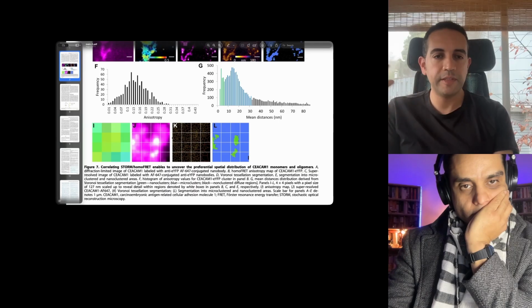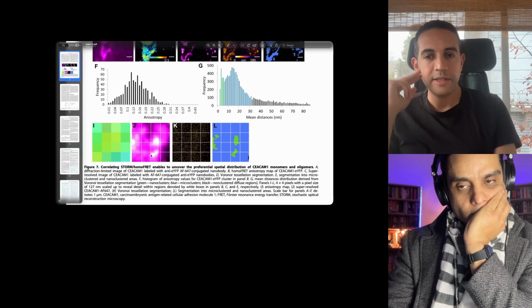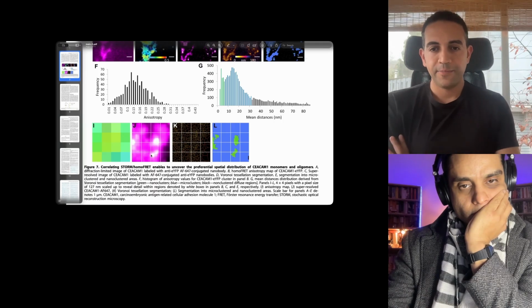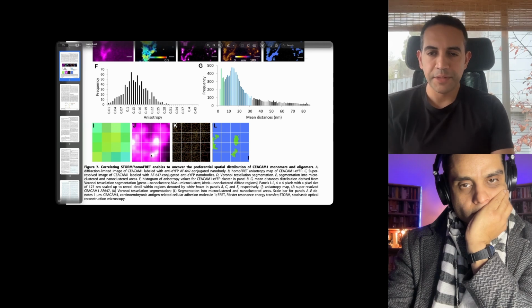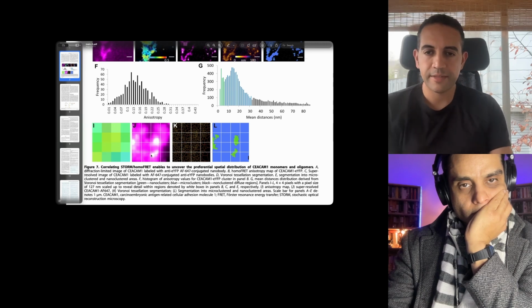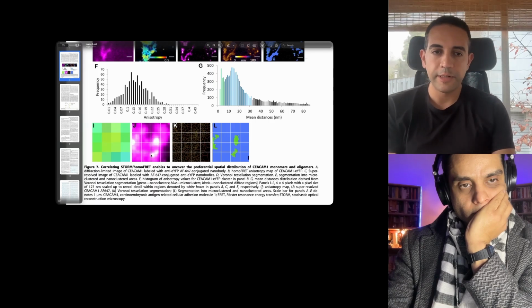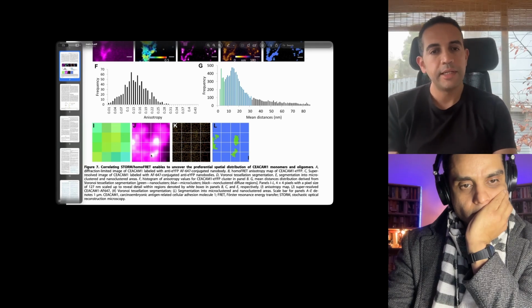But basically, in this paper, and I think we have that in a supplementary figure where we compare different regions, the very counterintuitive finding was that regions that are dense are enriched in monomers, and regions that are diffuse are enriched in oligomers. You would think that makes no sense because they're getting close to each other. They're probably more oligomeric, but we ran every control and made sure that was not an artifact of something.